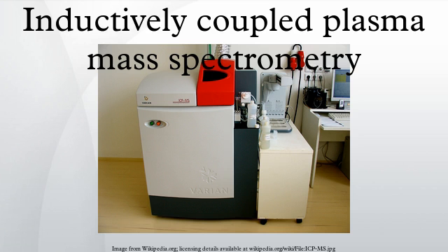One of the most frequent forms of routine maintenance is replacing sample and waste tubing on the peristaltic pump, as these tubes can get worn fairly quickly, resulting in holes and clogs in the sample line, resulting in skewed results. Other parts that will need regular cleaning and/or replacing are sample tips, nebulizer tips, sample cones, skimmer cones, injector tubes, torches and lenses. It may also be necessary to change the oil in the interface roughing pump as well as the vacuum backing pump, depending on the workload put on the instrument.